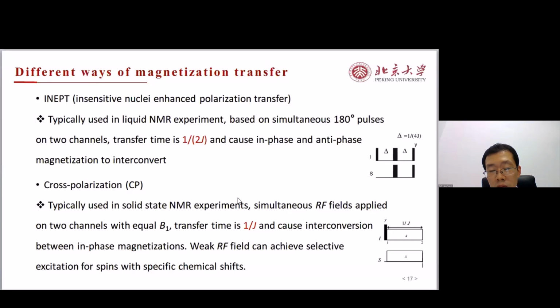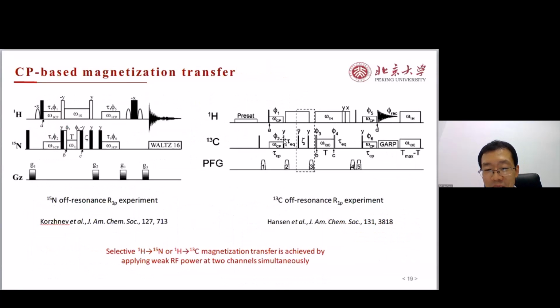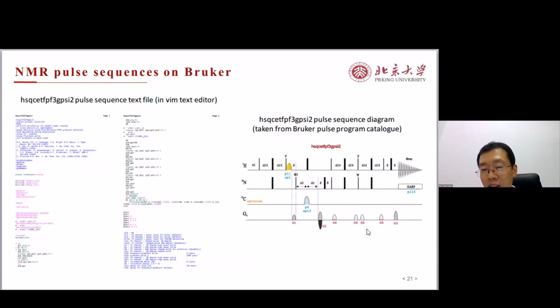Yeah, I think it's a hard question, because when I write a new sequence, I also have this question. For example, in this HSQC experiment, there are quite a lot of gradients, but in many cases the power is not unique. For example, for this G1 pulse, you can apply 50% or 10% or 70%. The results are very similar, no matter which number you use.